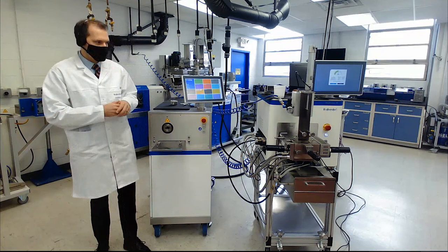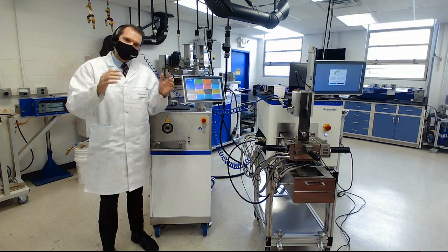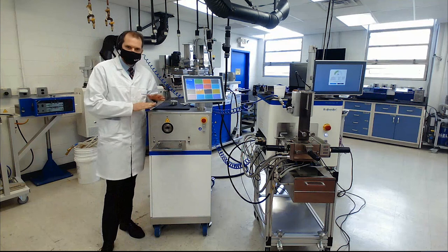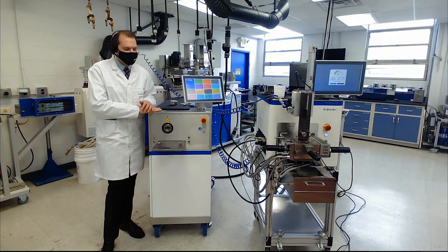It comes with an embedded meta bridge software control for your extrusion and mixer software. The good thing is that it's all in one box and the box got shorter so it fits actually on a countertop. Then we have the virtual successor of the intelli torque, which is metastation 80 with an eight kilowatts motor for 400 newton meters at 275 rpm.